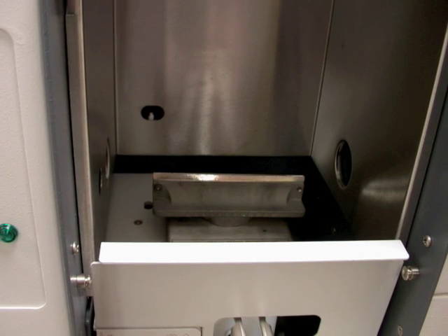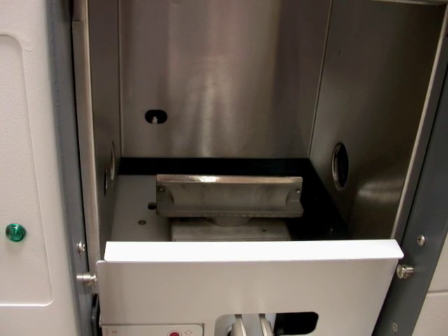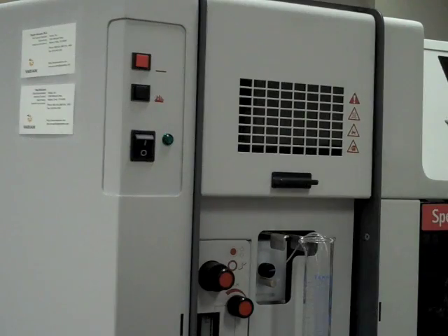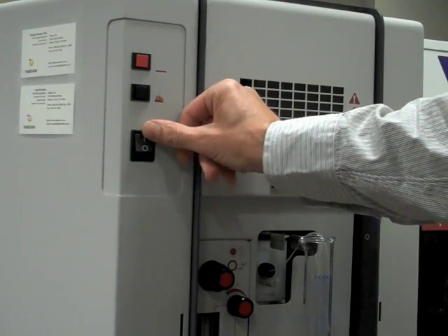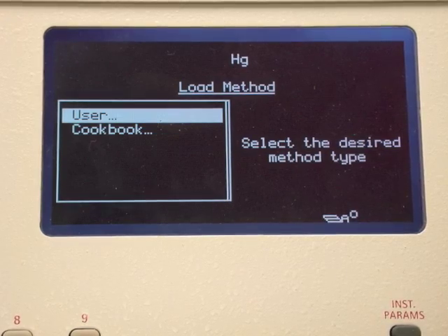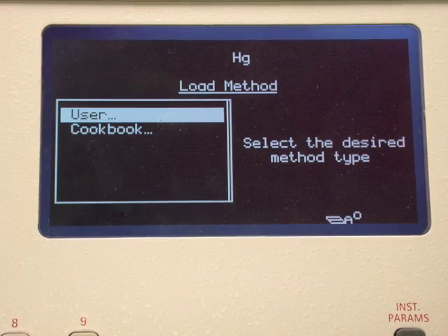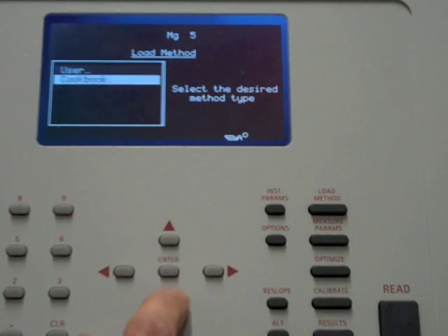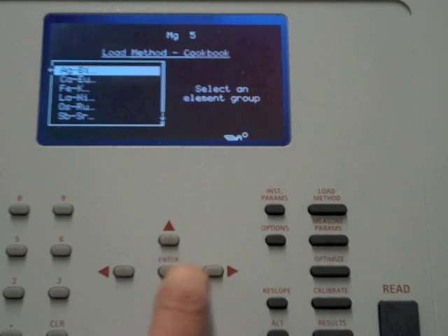Here is the burner head in the instrument. Turn on the power for the instrument with the rocker switch on the far left. After some initial diagnostic steps, the load page will open on the computer screen. Use the arrow key to highlight the cookbook and press the enter key to proceed to the next window.